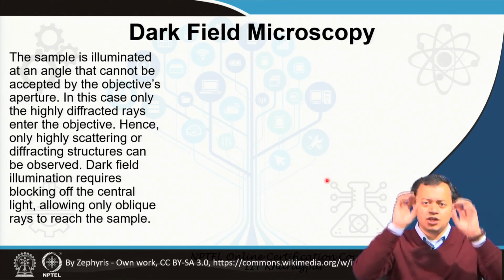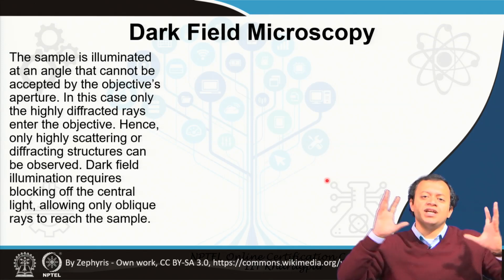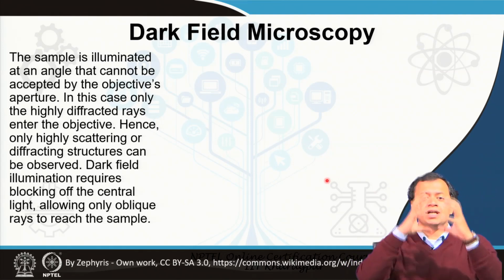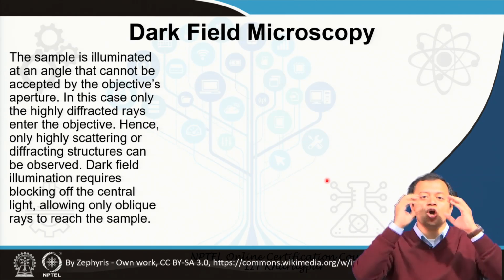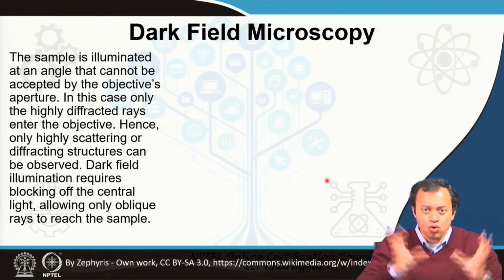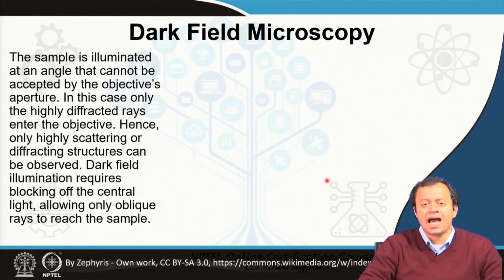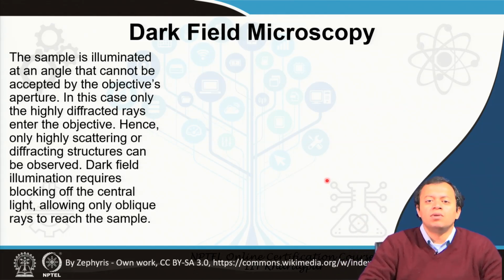Now, it may so happen that you have different types of metallic structures which scatter quite a lot of light. When you shine light, they scatter. All of them jumble up, and you get a jumbled, combined average spot where you are unable to distinguish one point from another. They are not all one together, they are different, and your resolution is also good, but too much light coming from all of the different areas has overwhelmed the detector, the eyepiece, and you are unable to distinguish.